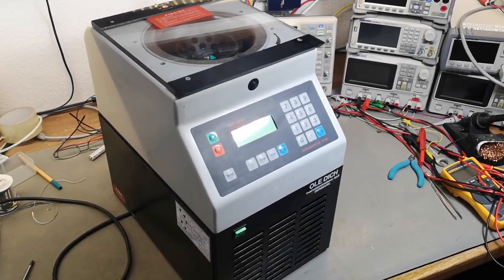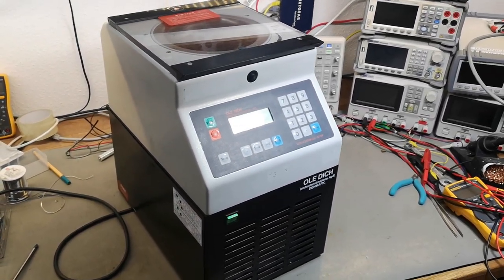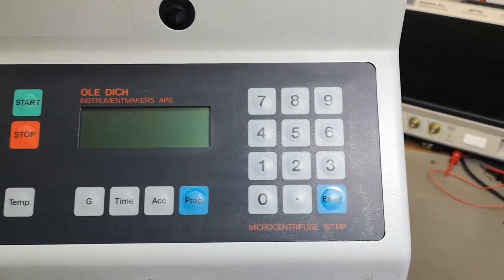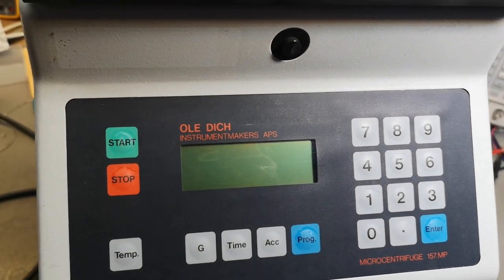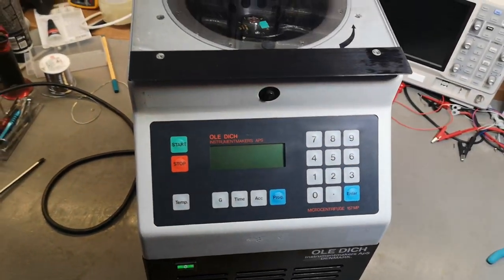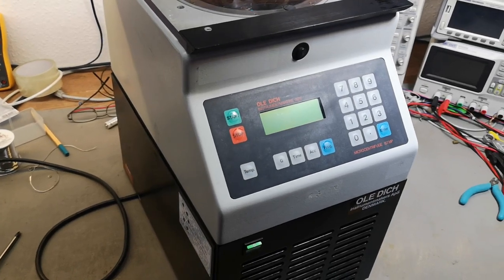Welcome to a new test and teardown video. This time something from the bio lab or medical lab — a micro centrifuge 157 MP from a Danish company called Ole Dich Instrument Makers APS. This unit is from 1992, as seen on the label.